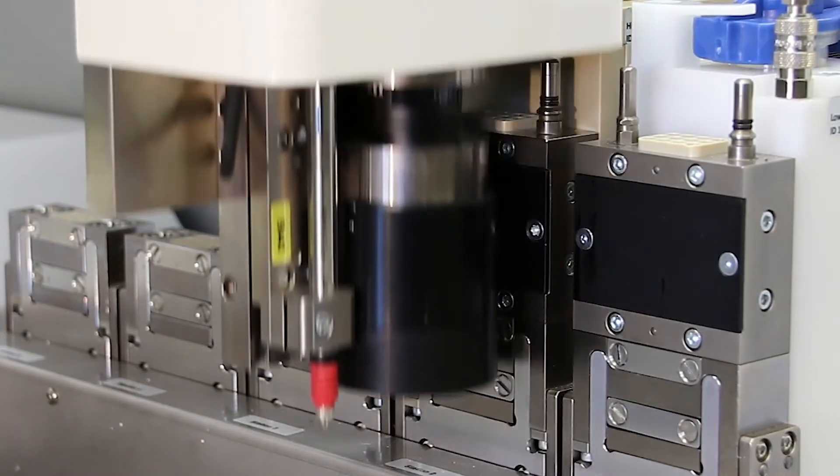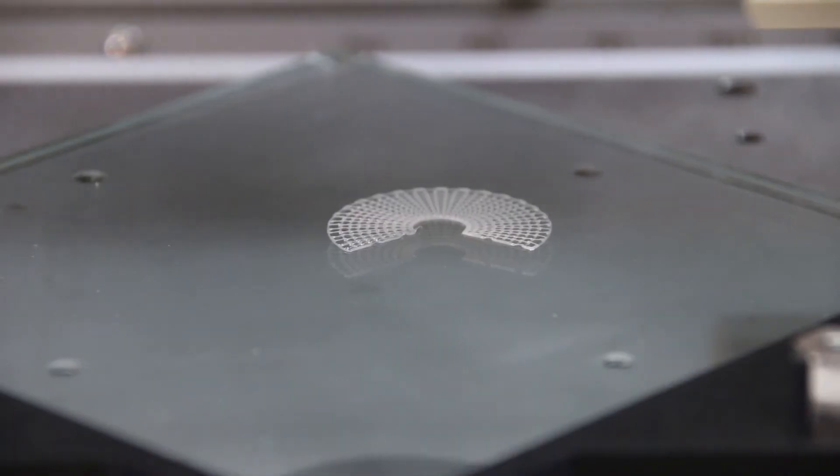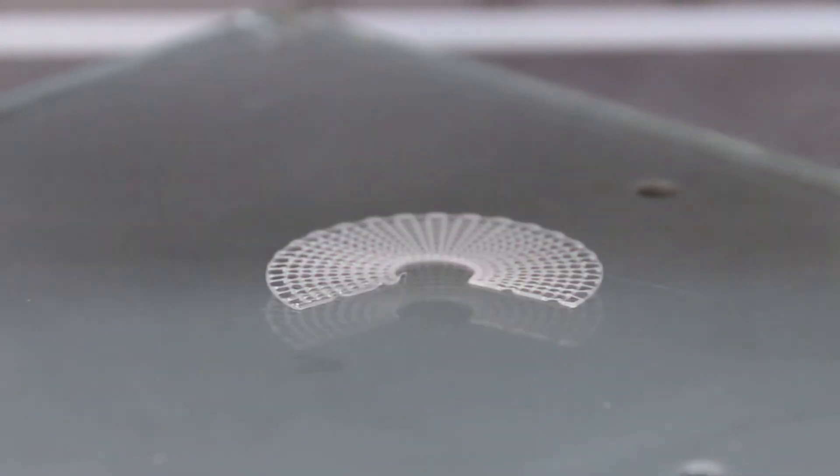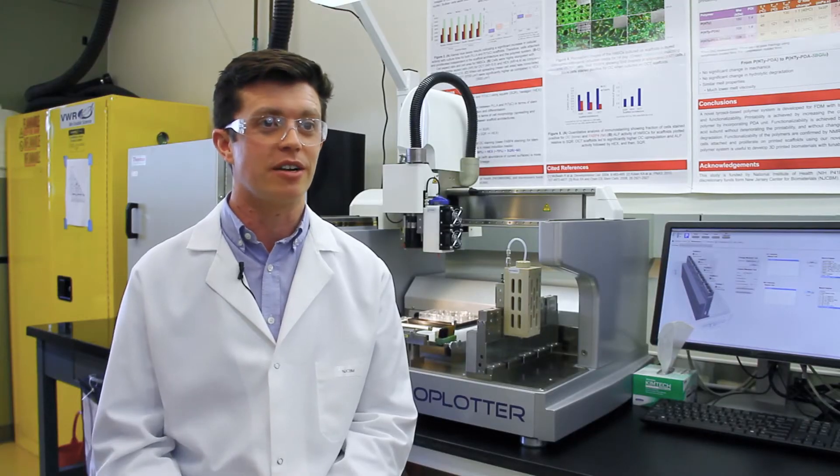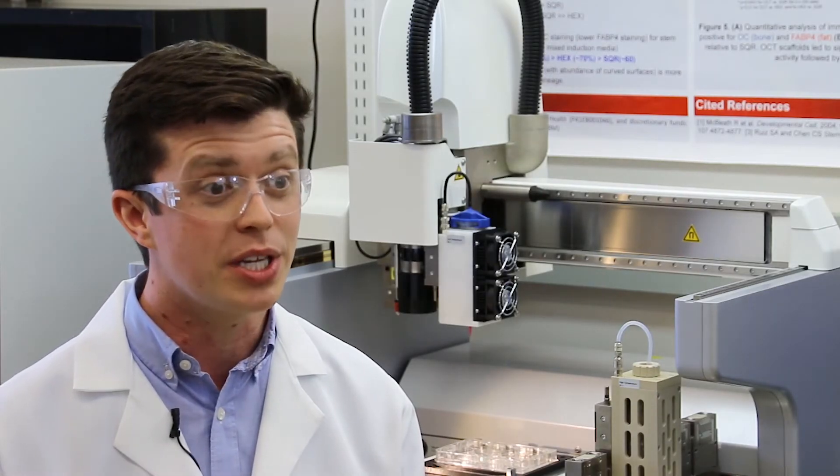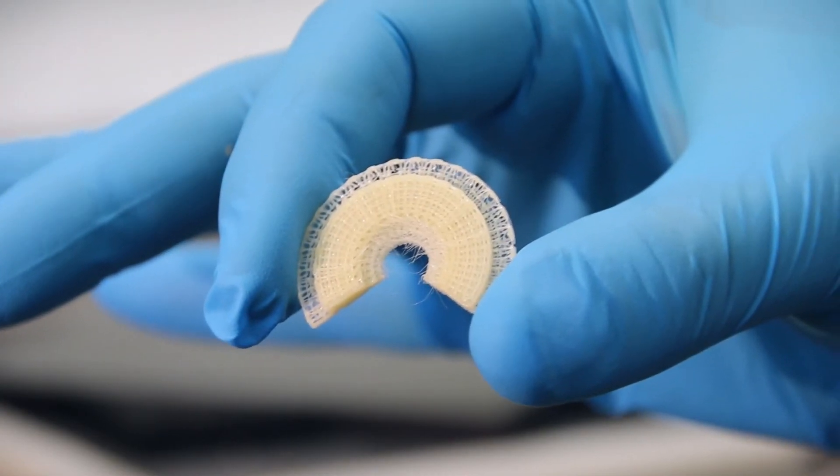Using the manufacturer series that we have, there's a built-in camera that takes images every single step so we can look back at the construct an hour, a month, or even a year later and ensure that we have complete control over the morphology of the scaffold.